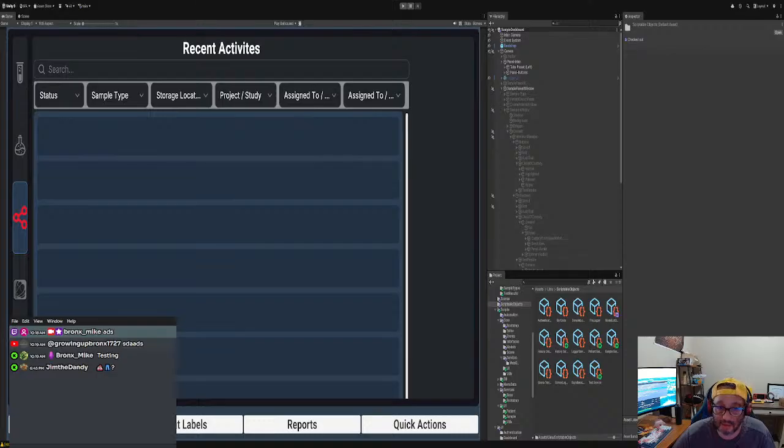You get the test results where tenant ID is tenant ID. You know what the tenant ID is? Remember, every organization has their own data, but we're all sharing one big database. But at the same time, we separate everybody who doesn't want to be together. Remember, some organizations are going to want to share data between each other, and some are not. You may want to support that, or you may not. I suggest you support it. That way you have more value for your app. Okay? All right. But also have good security, because if you're not, you're dead.